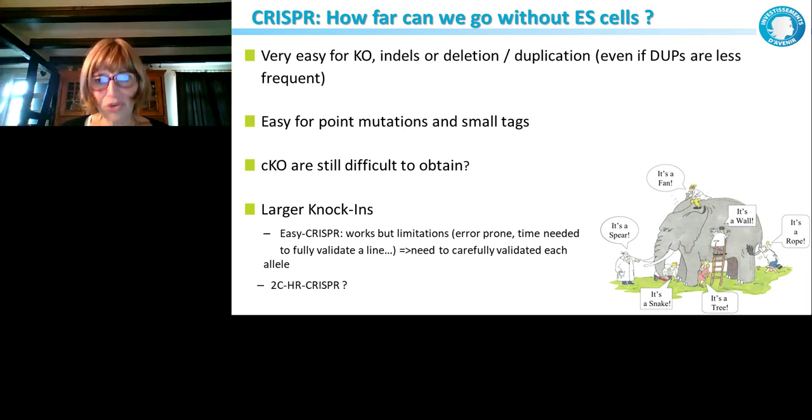And I think that you need to add droplet digital PCR, or even better, Southern blot that will give you the whole picture of your allele, because if you just do small PCR, you might miss some event. And I really believe that in the world, there are many lines that people believe they are fine because they did only small PCR. And if you would look much closer, you would see that everything is not completely fine. Then really be careful and look at the whole elephant, at the whole picture, instead of just at one little test that is sometimes not enough.